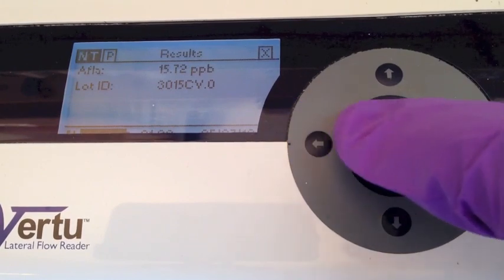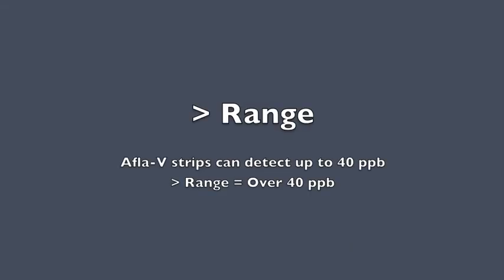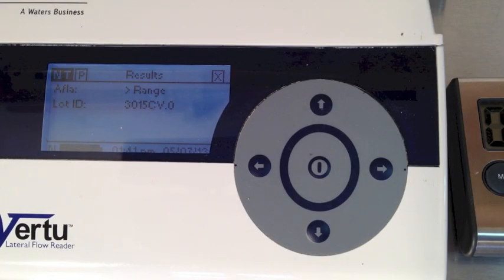Use the left arrow button to move back to NT for next test. A greater-than-range message means the sample is contaminated beyond the detectable limit for the test. We can use math and sample dilution to increase the range of the test.